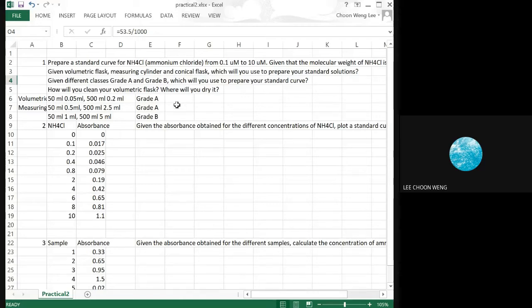So please, these are things that when you do chemistry, you learn a little bit here and there. When you're preparing standards, only use volumetric flasks. When you're preparing standards, opt for dilution, because measuring small weights is not accurate. Then use a volumetric flask where possible, and when you clean it up and dry it, only air dry it.